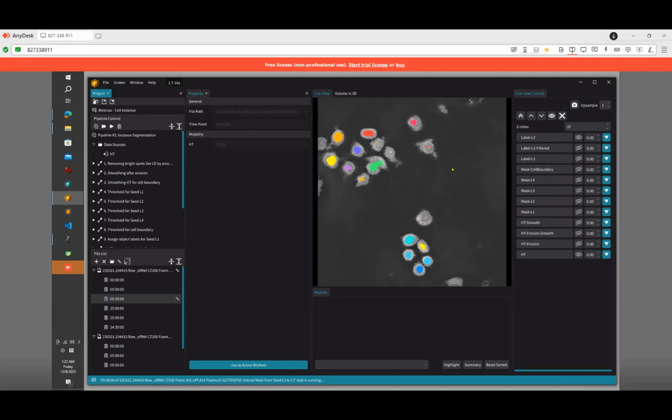The size, physical or the data size? This one, I believe each 10 points requires 160 megabytes of space. So you can see the cells identified.